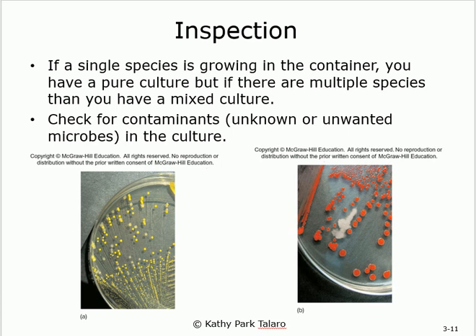It's contaminated. Like I mentioned, the tools that you're using, you're supposed to sterilize. So I take that Staphylococcus epidermidis, I put it in the nutrients, and I'm looking at it, I see two. You put one, or it comes from the air or something. So if you are using a pure culture, you're supposed to see one species only. If you find more than that, translation, contamination. It's contaminated somehow.